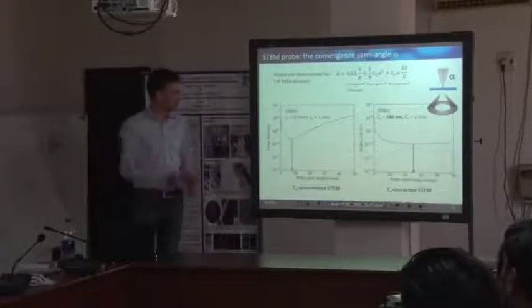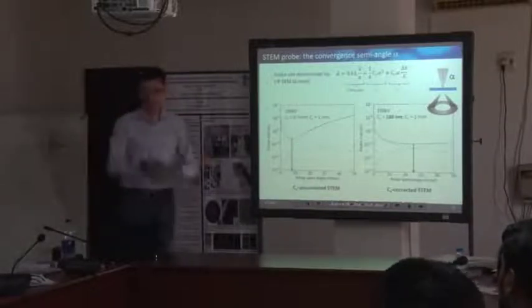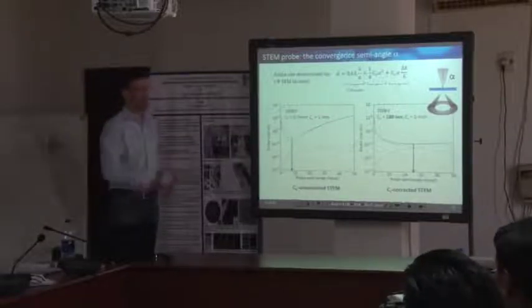So we can do atomic resolution scan imaging with a resolution of, let's say, 2.5 angstroms.